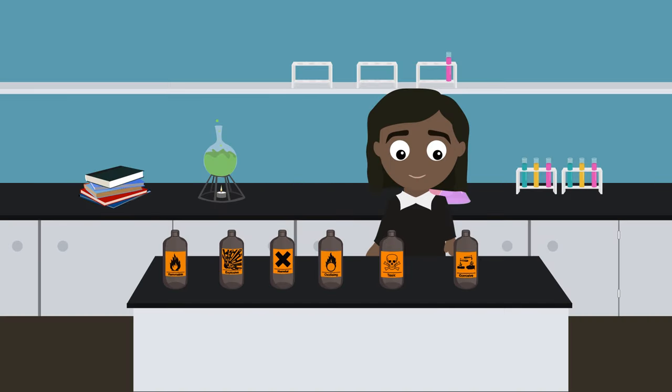So now you know to look out for these warning signs. Why not ask your teacher if you can look around the laboratory and spot these signs. Now you know what they mean.